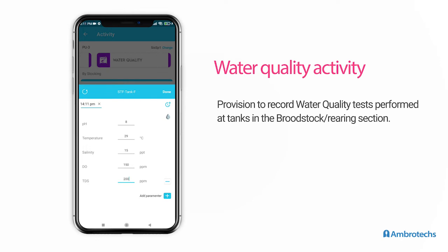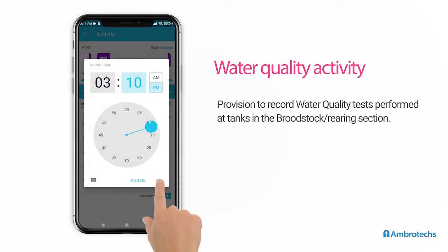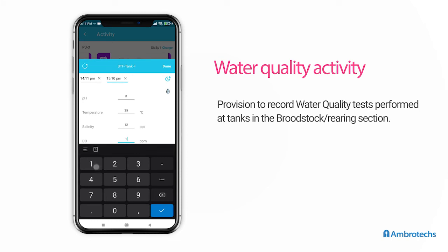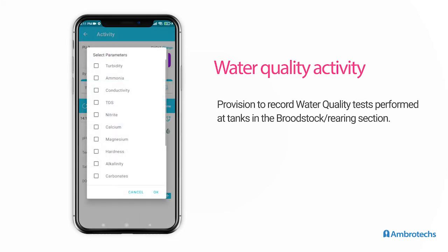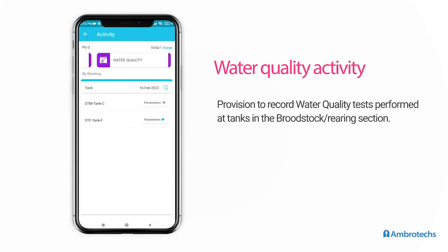Click on the time icon to set time. Multiple records of parameters can be saved at multiple times. Click on the Done and Save button to exit the pop-up. Click the Parameters button to view previous entries.